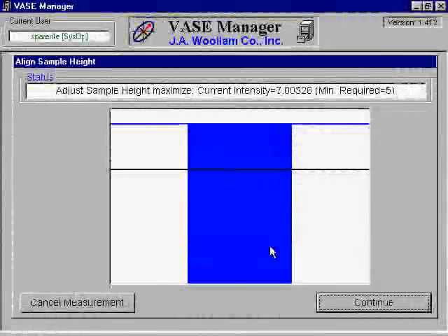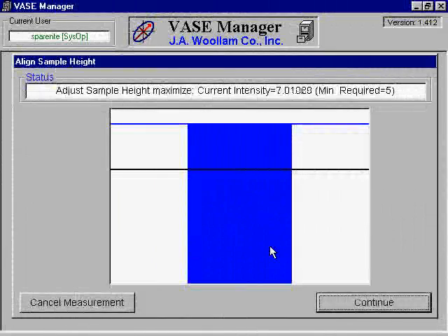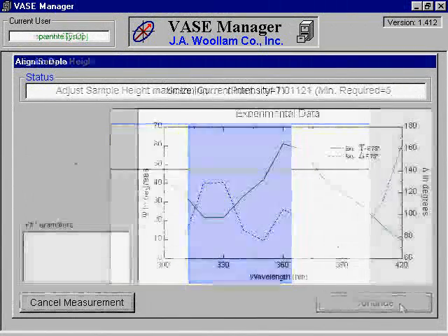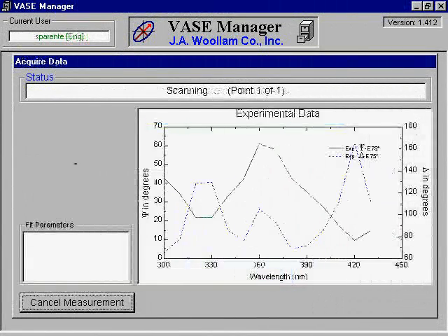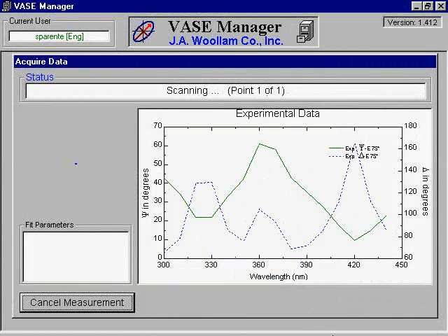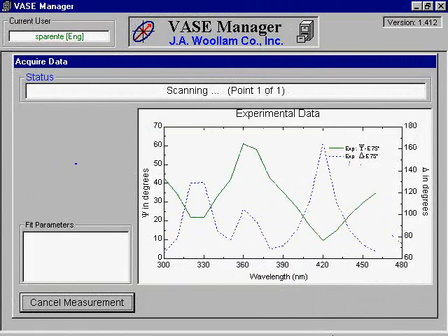Once you have appropriately prepared for the scan, click Continue and your scan will begin. Each point will be scanned in order and the data will be presented on the screen. A medium to large scan can take a fair amount of time depending on the material. Since the scan is fully automated, you do not have to be present during the entire scan.